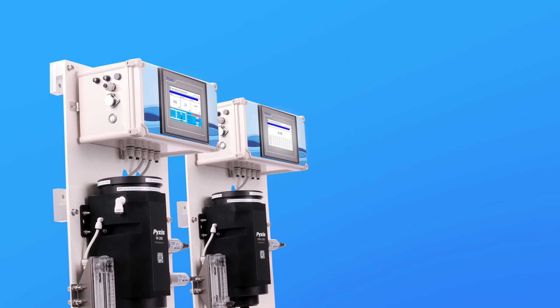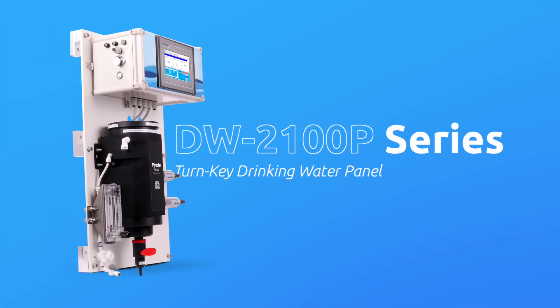The DW Series are offered in two formats to allow for a wide variety of application measurement needs. The DW2100P is a fully integrated and turnkey drinking water panel offering real-time measurement of ultra-low turbidity, pH, pH-compensated free chlorine or chlorine dioxide, and temperature.